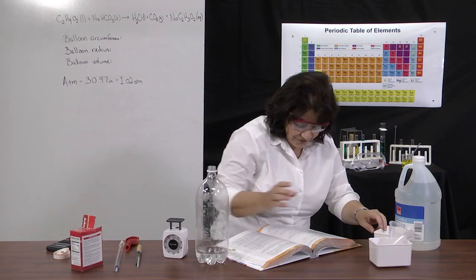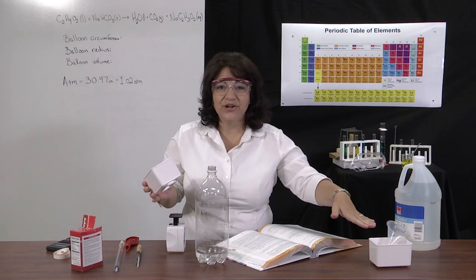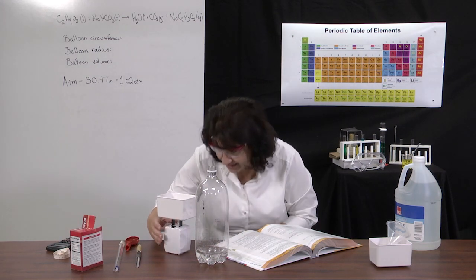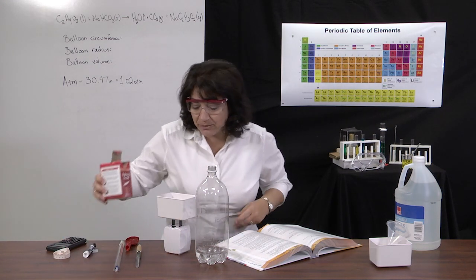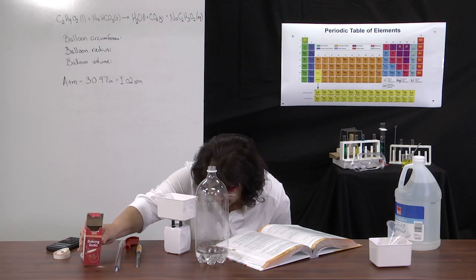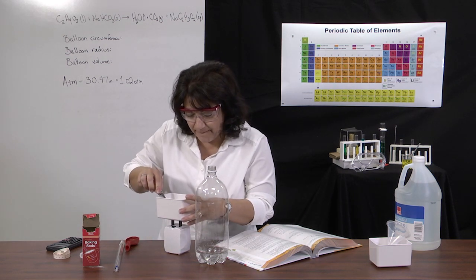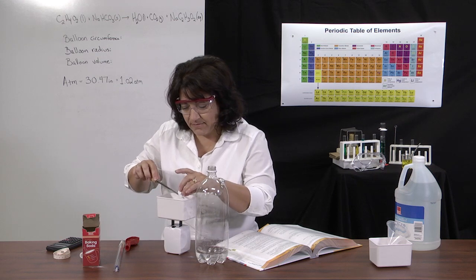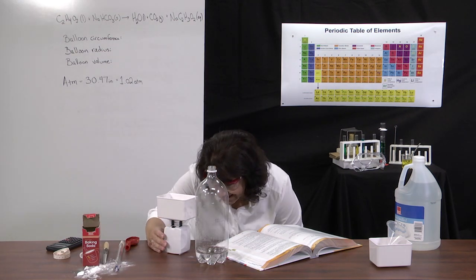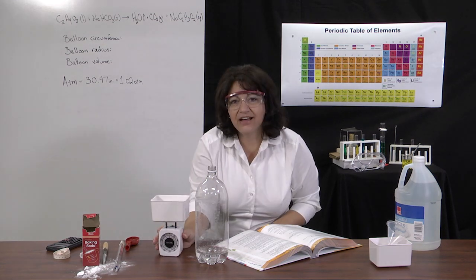Now, I'm going to do the same thing. We have to measure 30 grams at least of baking soda. So I have a different container. You can wash out your original container if you wanted to dry it and use it again. But I'm going to make sure it's zeroed again. And you want at least 30 grams. You can have a little bit more, but at least 30 grams. Well, I have almost 50. I'm going to take a big chunk out of that. Whoops, but we'll clean that up later. Okay, so I have about 40 grams of baking soda.